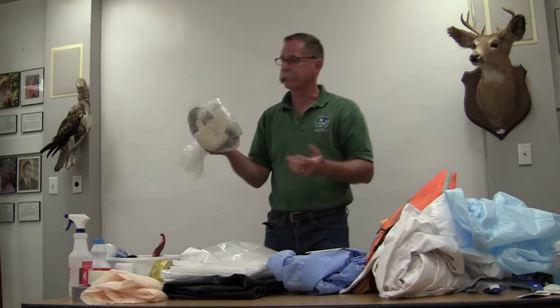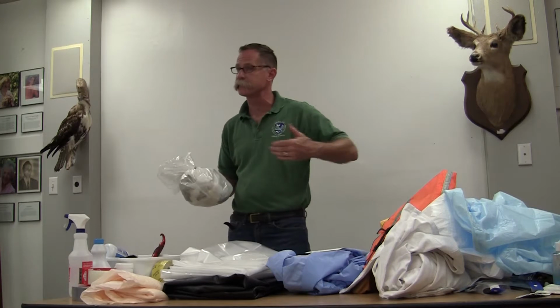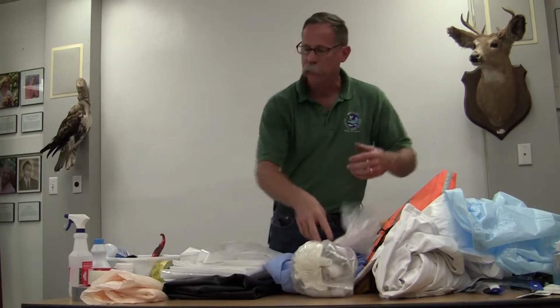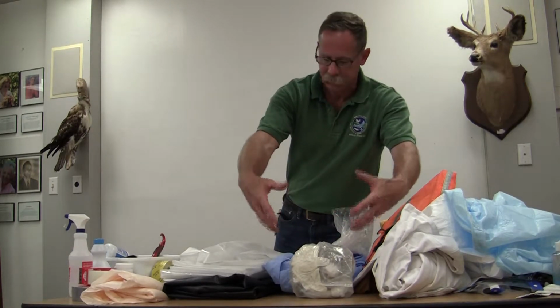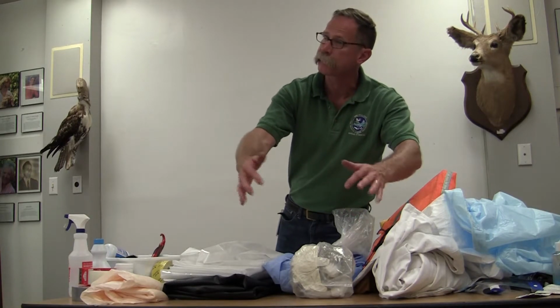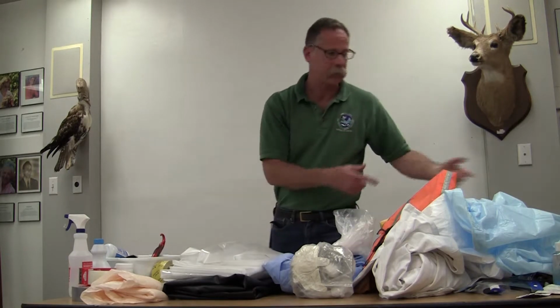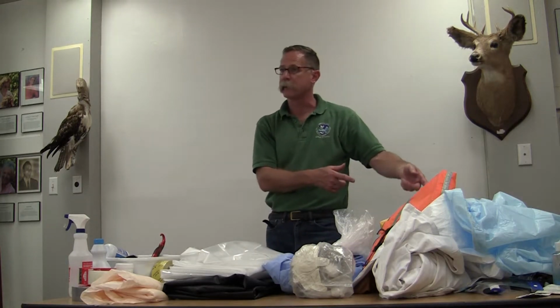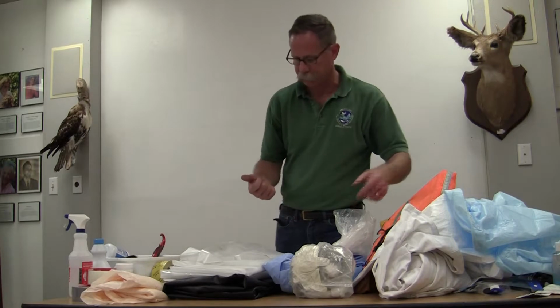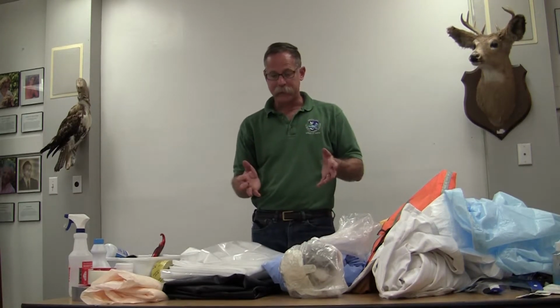Now you have to be mindful if it's an animal that's been shot or is on the side of the road. It could have compound fractures, with bone fragments sticking through. When you're picking it up initially, or even with the second bag, you want to be a little bit gentle. If you feel anything that feels like it's going to come through, just stop. Or if you see that automatically, then you want to wear a heavier pair of gloves, like leather gloves, instead of the latex ones. So that's the way you bag up specimens.